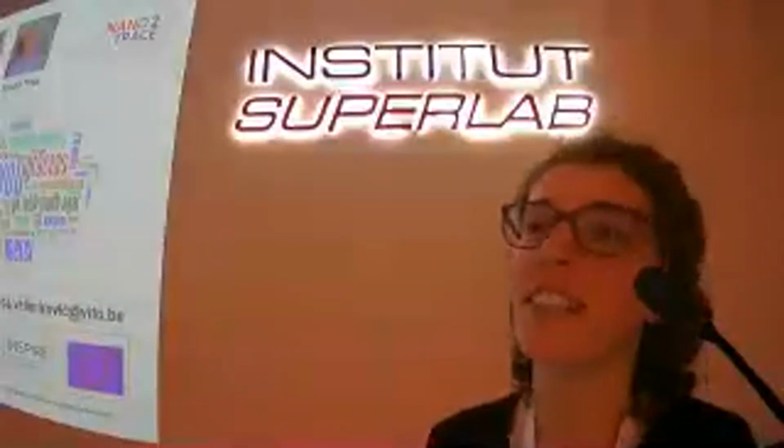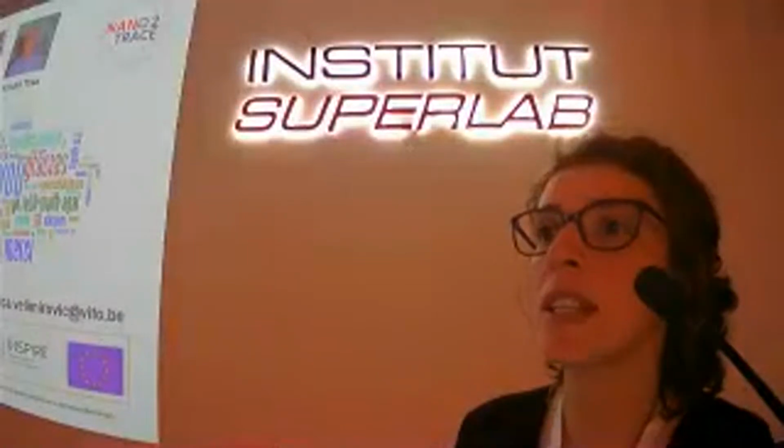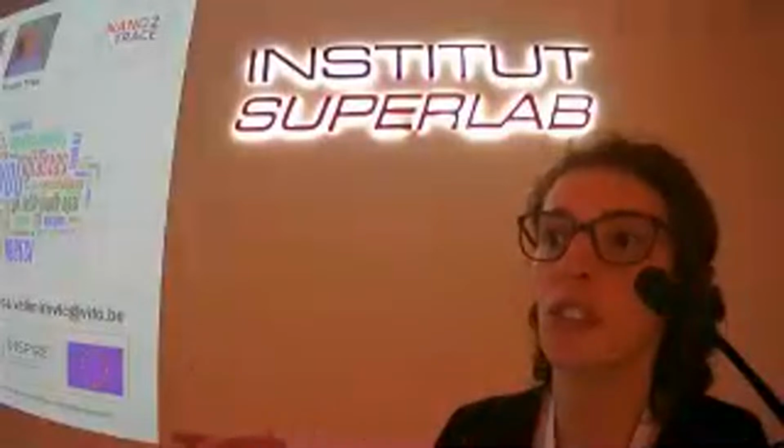Yes, we do it the same. For example, for extensive weathering, I have the UVB, for instance. It goes very fast, and you see what's going on. Dina did this weathering in Thessaloniki at the university. We also have a collaboration with DTU, because when we wanted to buy a second-hand chamber, we drew straws to decide who would do it, and this is how it goes. But companies who have products have it there and just do it on a regular basis. Thank you.